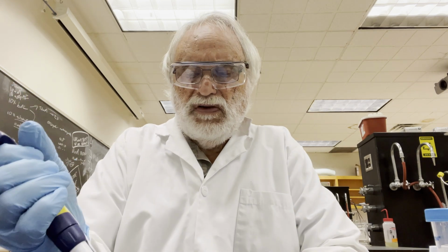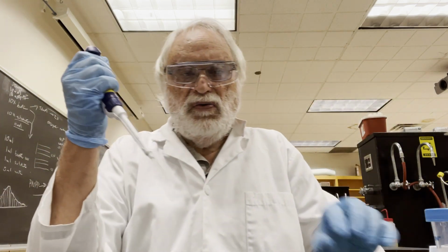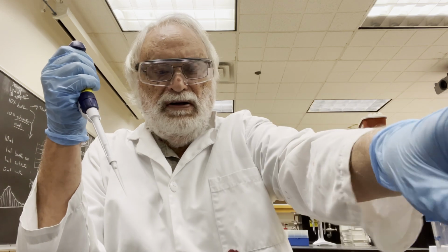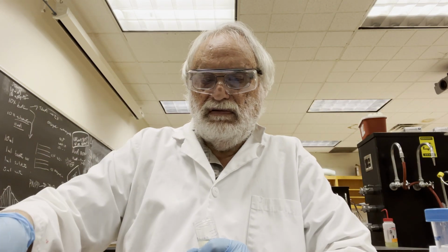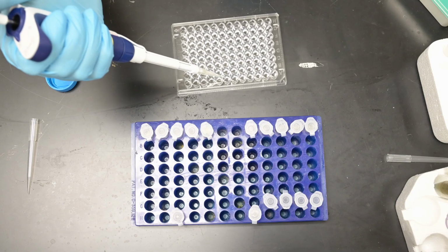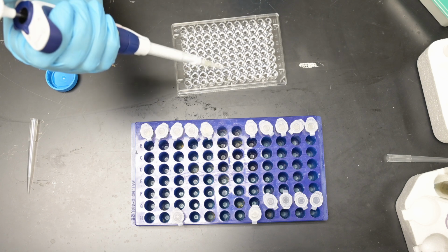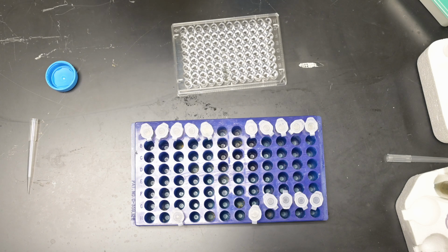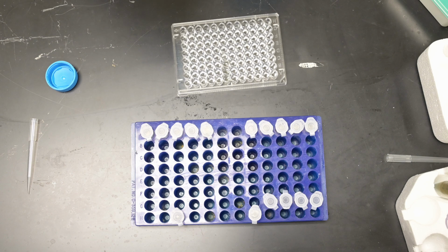In all these wells, you'll notice that I laid things out in an order. Right here, in row 7A, I'll put 200 microliters of the 20 millimolar substrate. I'll put that into 6 wells going down: 7A, B7, C7, and so on.